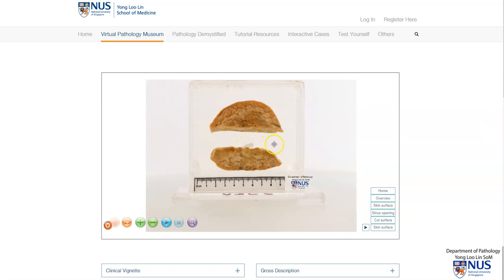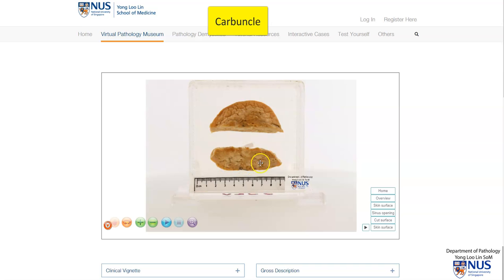Hello. This is a virtual pathology specimen of a carbuncle. Let's orientate ourselves — we see two tissue pieces here. This is the cut surface of the skin.